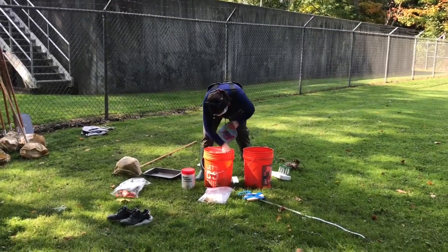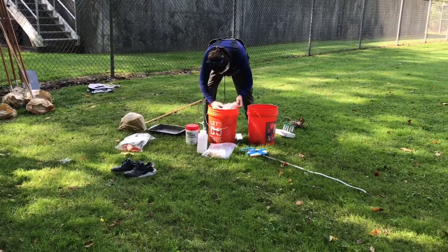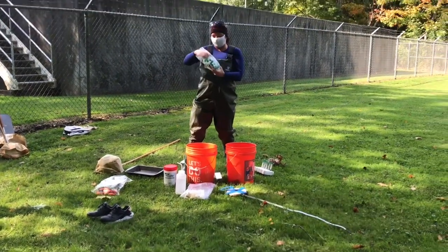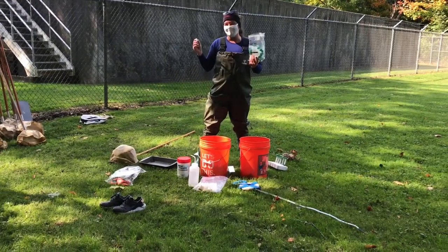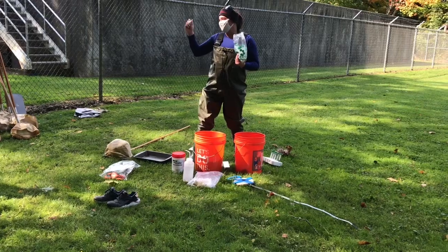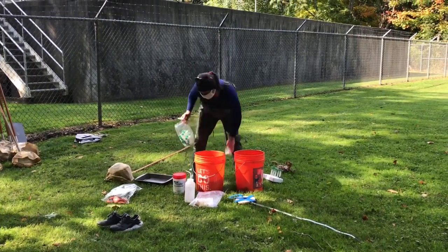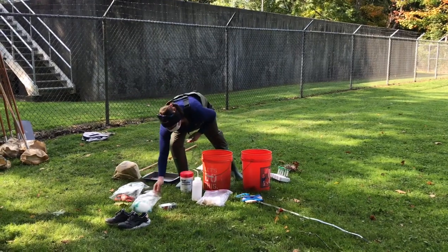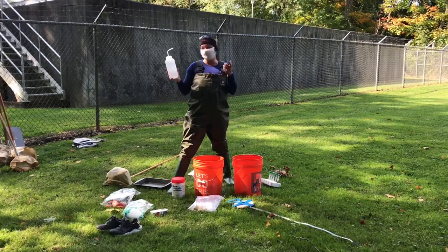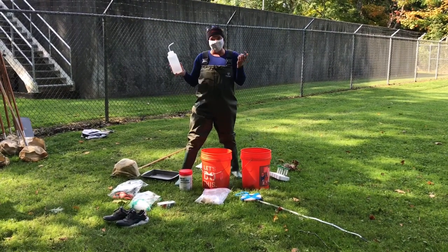Some of the supplies that you will definitely need is a vial. And what I'm going to have you do is put your name and PM lab on the outside of your vial. There are Sharpies here that you can use. You're going to want to fill up your vial with a little bit of ethanol. This is 95% ethanol. That's probably an important value to write down. This is our kill agent.